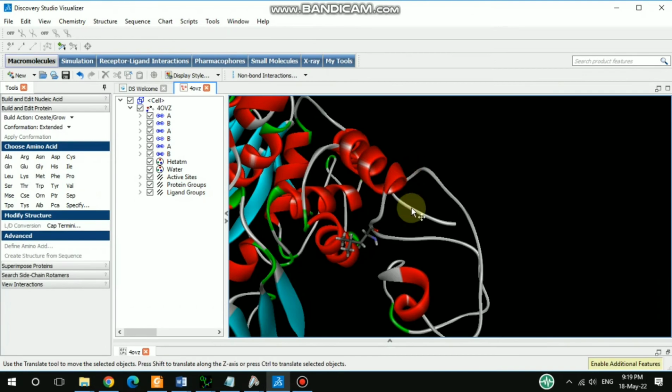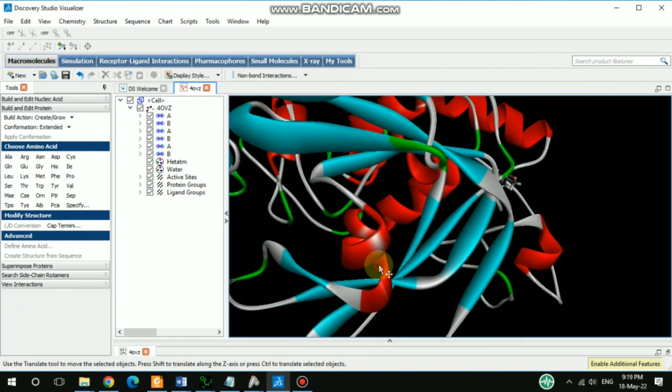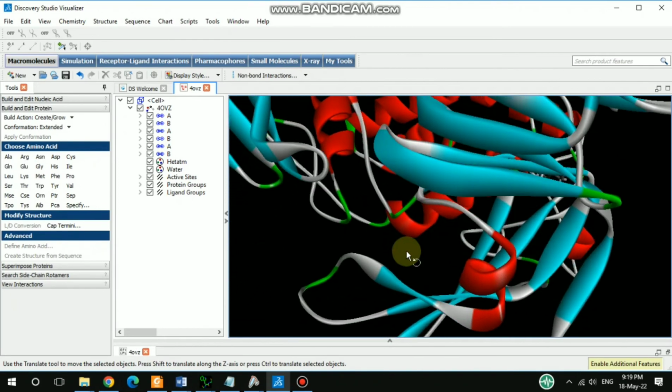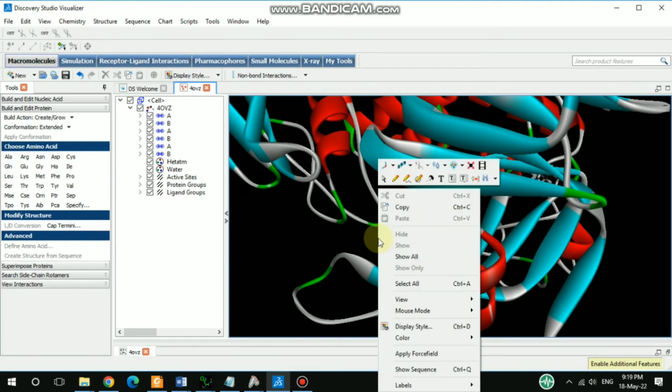Alright, and then again what I do, make it the initial position.